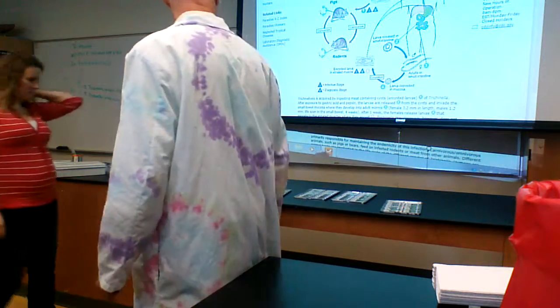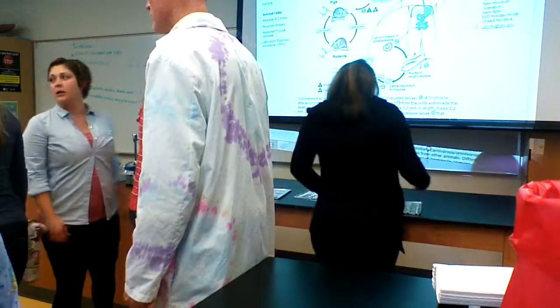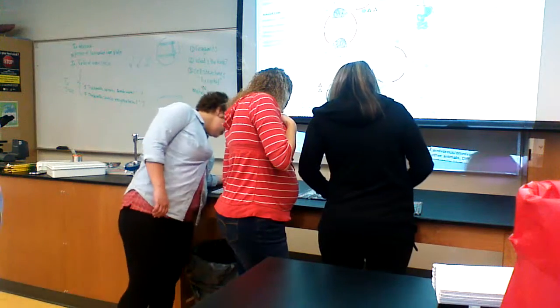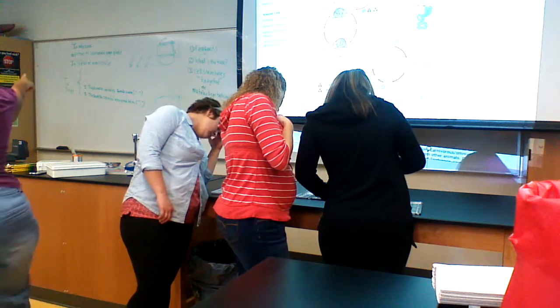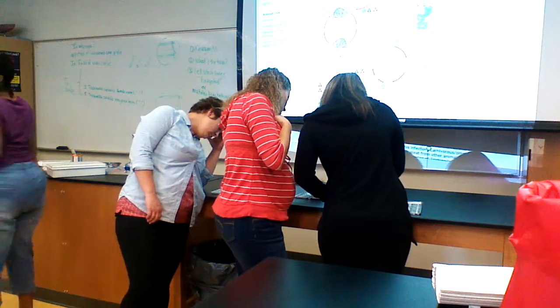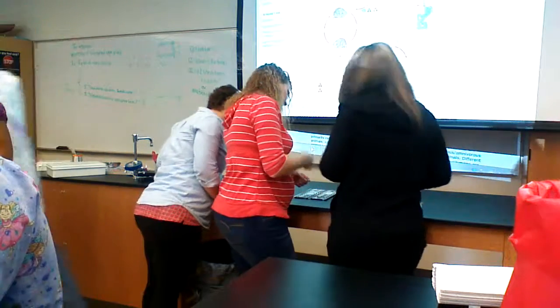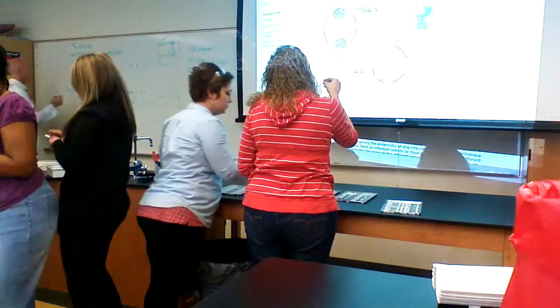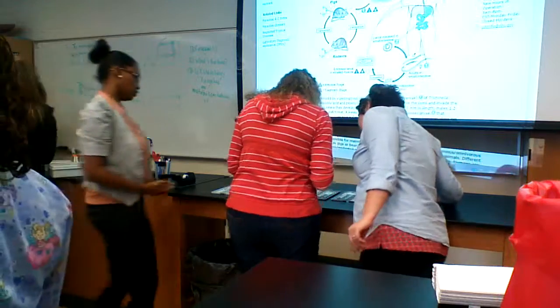Yeah, so sorry. There's three things I want. Picture of Sabouraud agar. Let me write number 1, 2, 3. Sorry, I started different than I did. 1, 2, 3. A plain stuff on, like, does this have any growth?